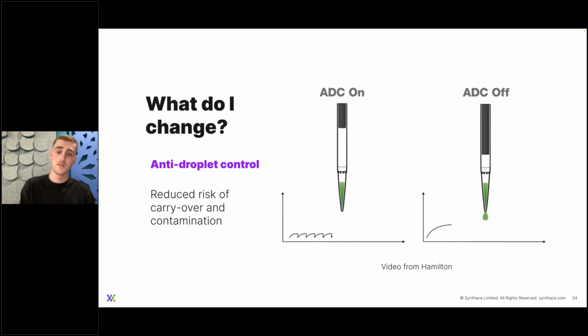And actually, features like this are really useful. Instead of having to tweak multiple liquid class parameters, if we have a catch-all solution like this, it can save you a lot of time. If you see features like this, do send them my way because they're really cool.